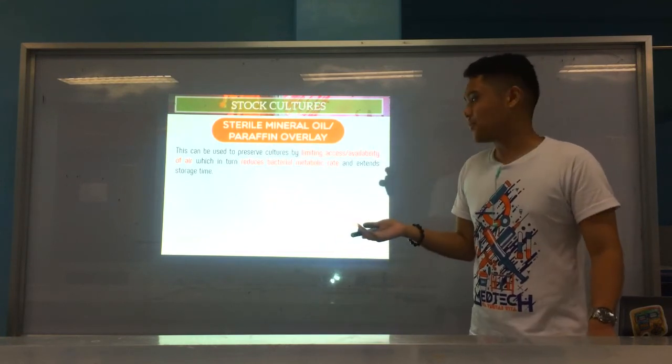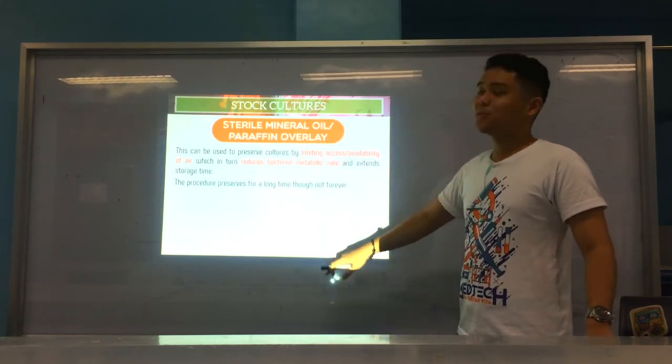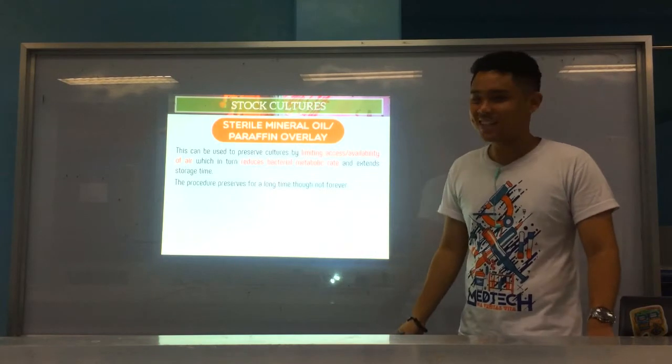Para ma-prolong po nila ang life, okay? Alright. This procedure preserves for a long time, pero not forever. So wala talaga forever, guys. Even dito sa bacteriology. Okay.